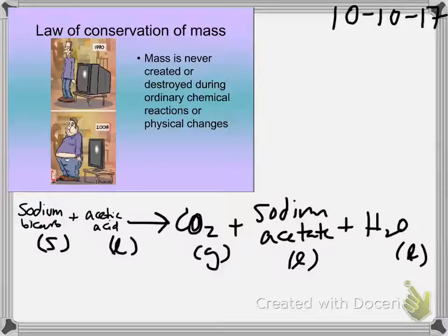Now the goal, of course, was that in the closed bag, what would happen? The CO2 would stay in there. The mass would be unchanged. Yay! Look at us. We proved the law of conservation of mass. Did anybody actually have that work out? Didn't think so. So it's hard to get everything to go just right.